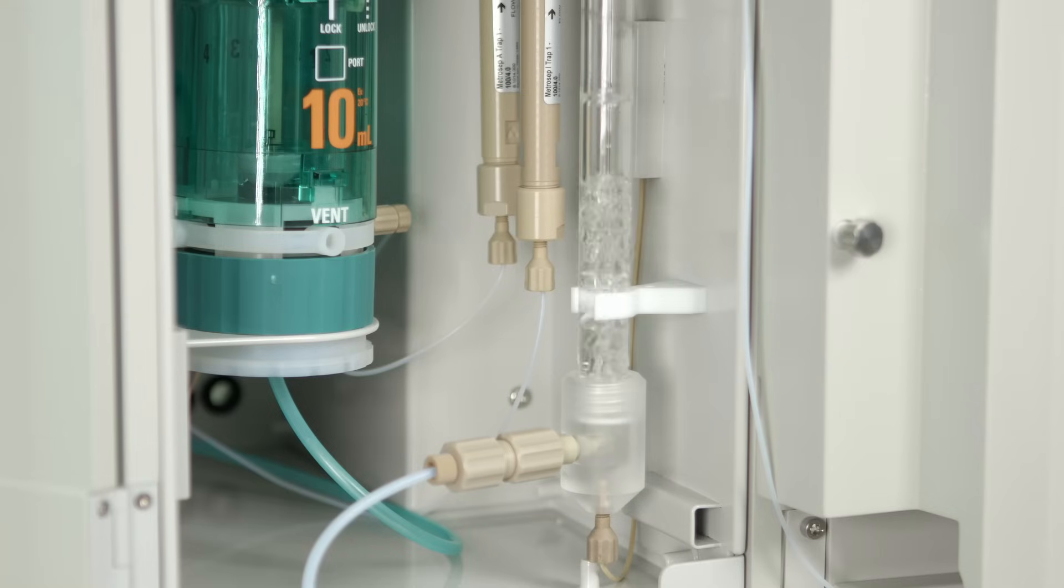The final step is the actual identification and quantification of the individual fractions of the adsorbable organically bound halogens. The absorption solution is automatically transferred into the IC system for analysis.